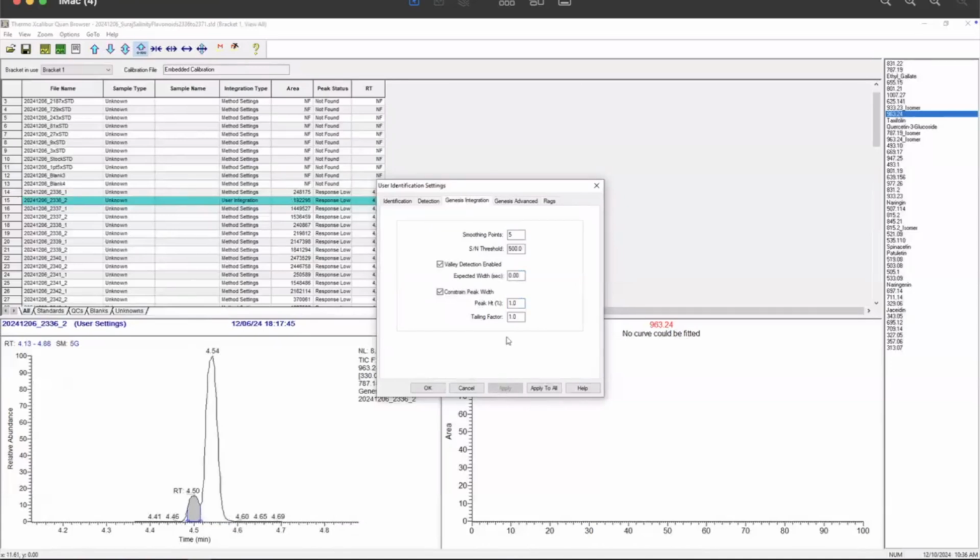Okay, so now we're getting somewhere. So I clicked in this. I think it's really this valley detection thing that seemed to be kind of helping. But the problem is you can kind of see that it's not really catching that full peak. So let me see if we go down a little bit.